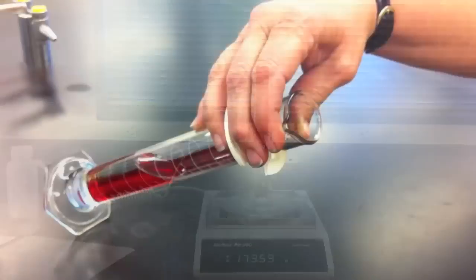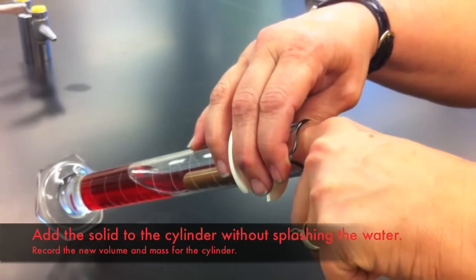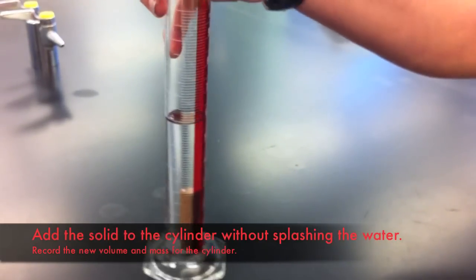After recording the volume of water in the graduated cylinder you can very carefully add the solid to the cylinder. Be sure not to splash any of the water out of the cylinder.